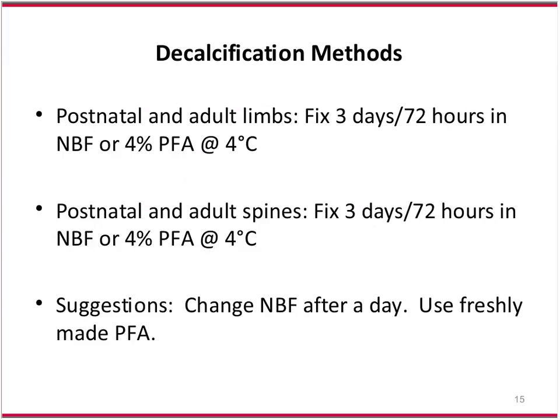Postnatal and adult mouse limbs, we fix for 3 days, like I mentioned, 72 hours in NBF or 4% paraformaldehyde. You can do 4 degrees or you can do room temperature. It really doesn't matter. I do, however, switch out the NBF daily as well as the paraformaldehyde.